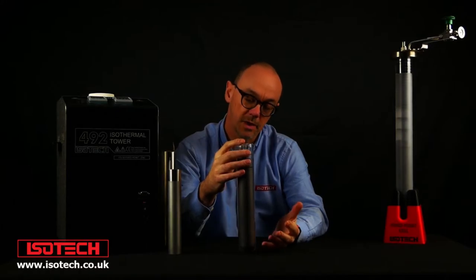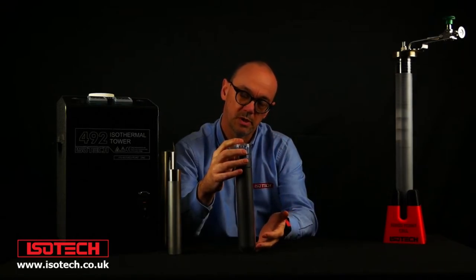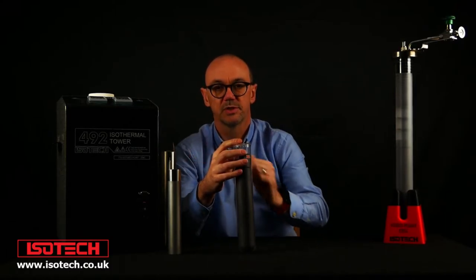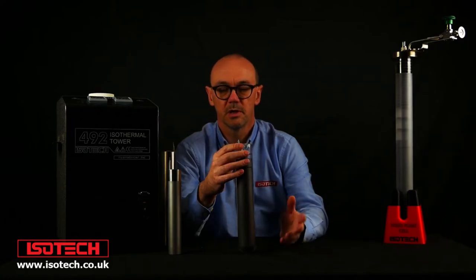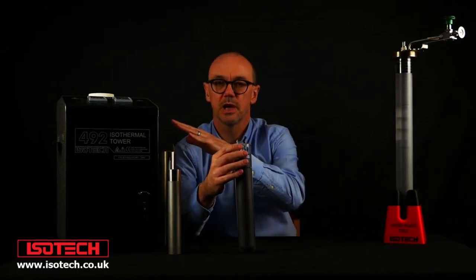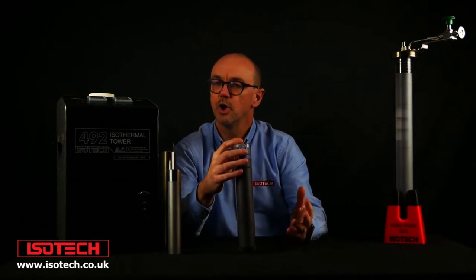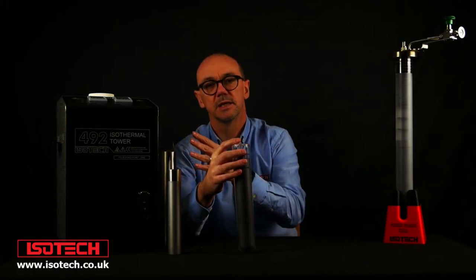Here we have a quartz glass aluminium fixed point cell. We can see through the glass the graphite crucible — inside the graphite is the pure aluminium — and we can melt and freeze this in a furnace the same as the other cells. The optimal cells we would use with primary SPRTs, while the smaller more affordable slim cells are good for working standards or very high accuracy industrial thermometers. The ISO tower sits halfway between the two: the uncertainties are almost as good as the large cells, yet they're a lot more affordable and the performance is better than the metal cells. The ISO tower is patented and is really quite a useful device.